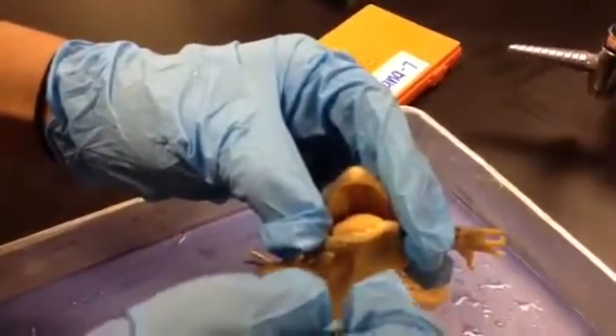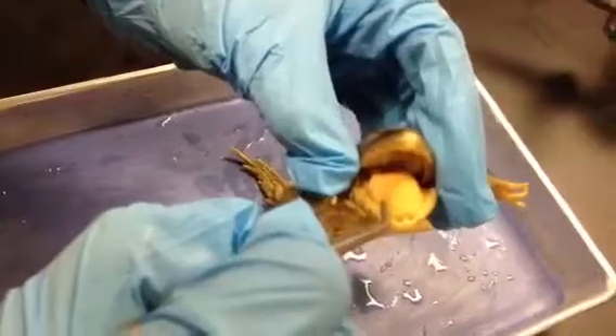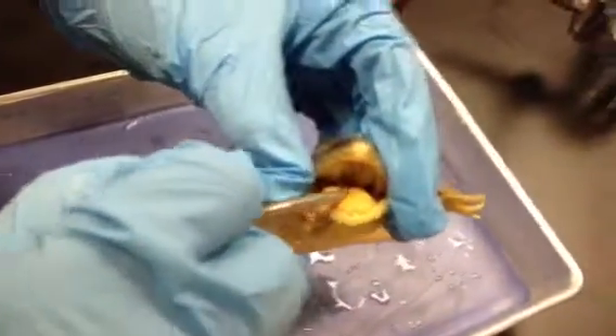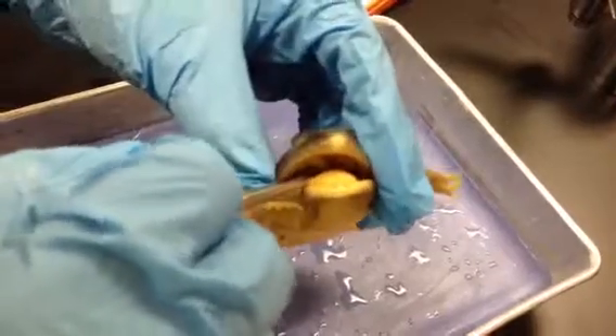The vomerine teeth are on the top, the maxillary teeth are on the sides, the opening to the Eustachian tubes are inside here. We have the gullet openings, which is on top, and the glottis is on the bottom. The palate is on the sides.